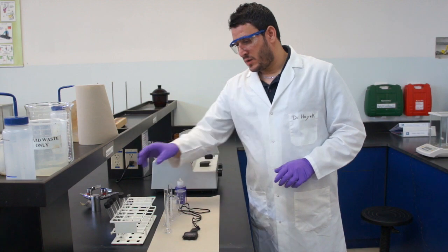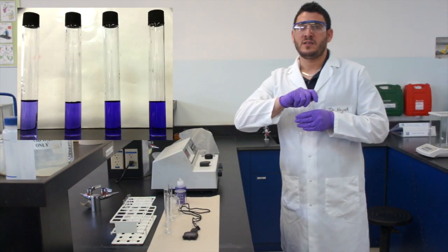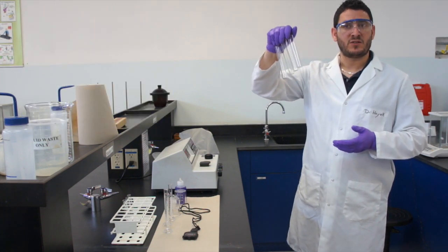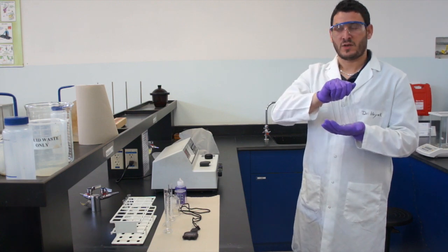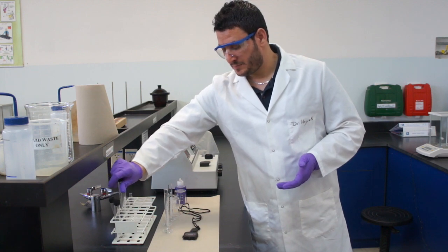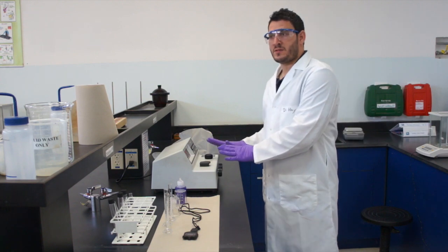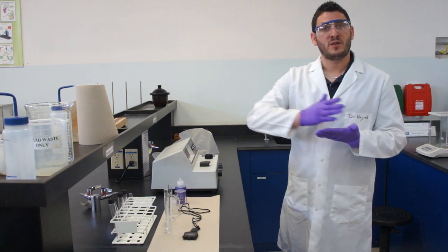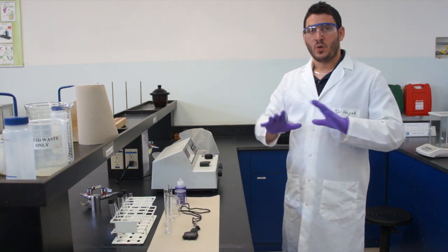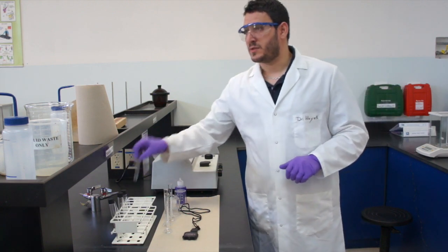Now, in these four tubes, you can prepare the diluted solutions, okay? So you prepare 10 milliliters each, every time, okay? And I suppose you did the calculation before coming to the lab. Now, once you prepare your solutions, you can just measure the absorbance. And this is going to help you to determine the molar absorptivity from the calibration curve. Once you have the data for your calibration curve, you can start your experiment.